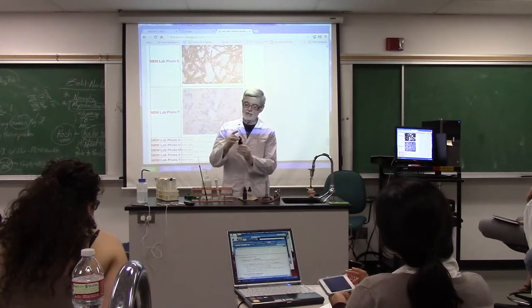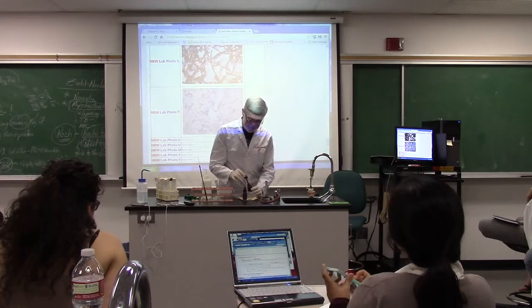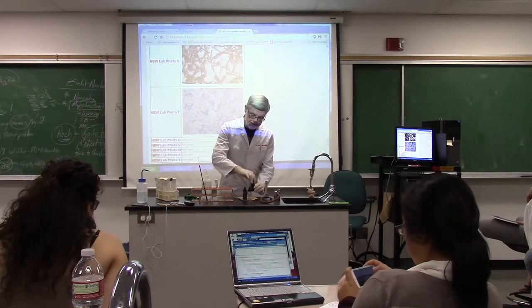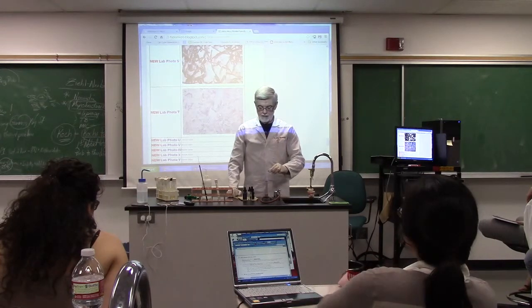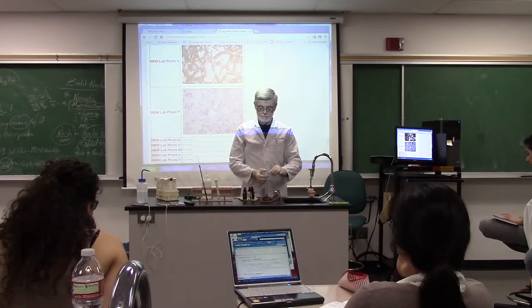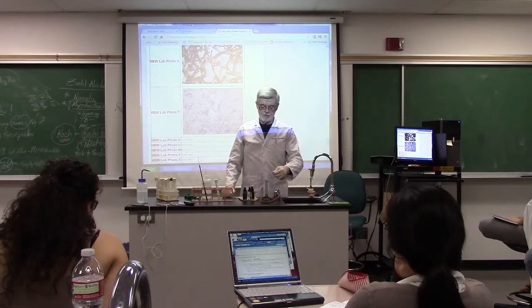So, we're going to unscrew this one. See, it's a big mess. We're going to get a big amount of it, and we're going to put 2 or 3 drops, get a good bubble of it, and we're going to keep it balanced so that the circle itself is covered. We're going to pass it through there, and then back, balancing it. Just watching the edges. We are gently raising the temperature of the carbolfuchsin, and now it's beginning to withdraw.